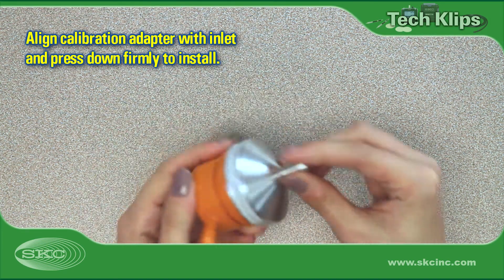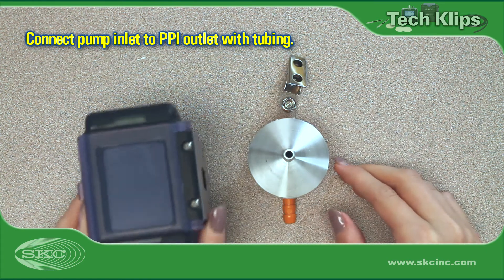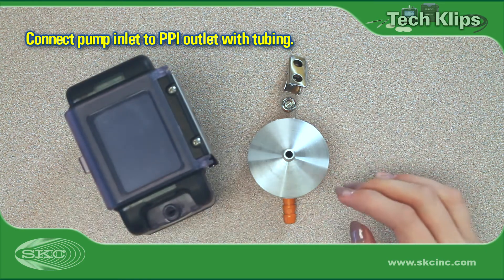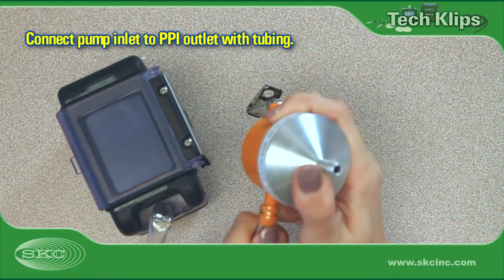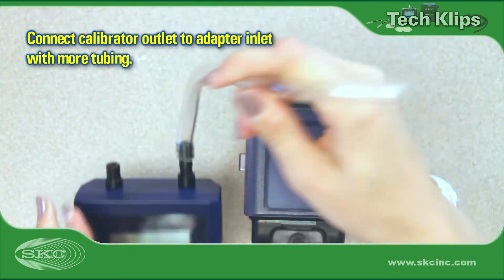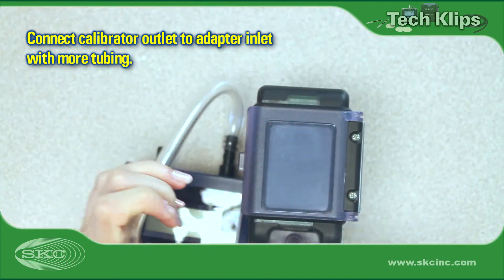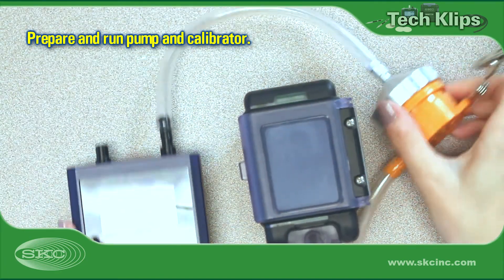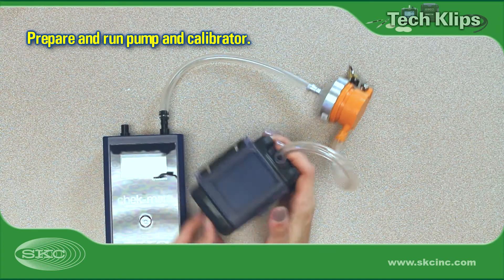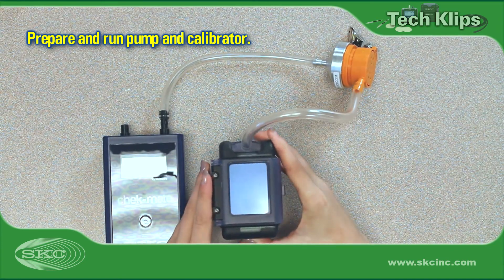Be sure to establish a good seal. Connect the pump inlet to the sampler exhaust with tubing. Use a second length of tubing to connect the calibrator to the calibration adapter. Run the pump for 5 minutes and prepare the calibrator according to manufacturer instructions.